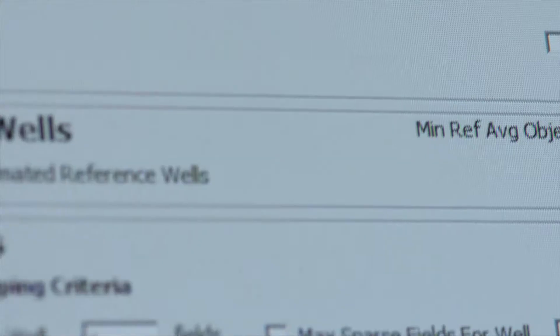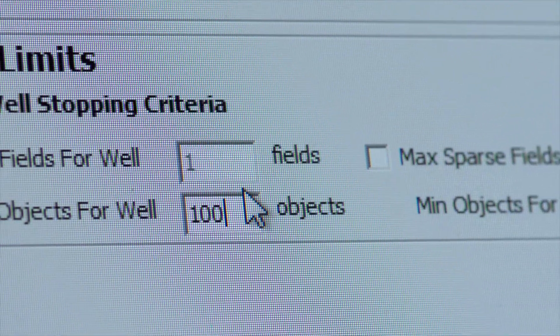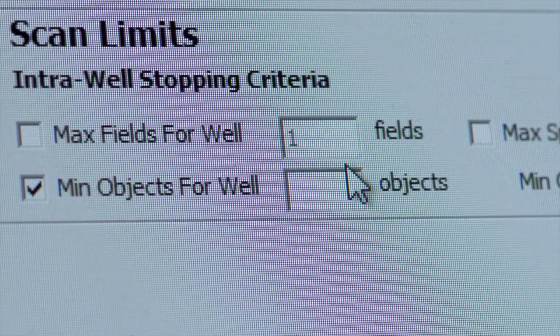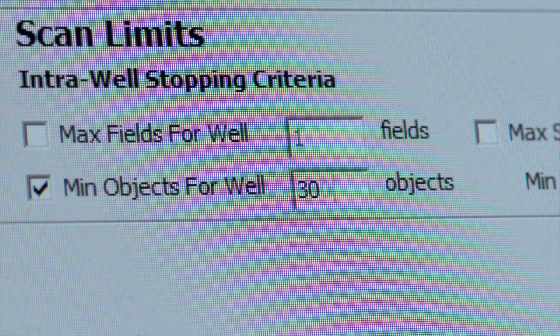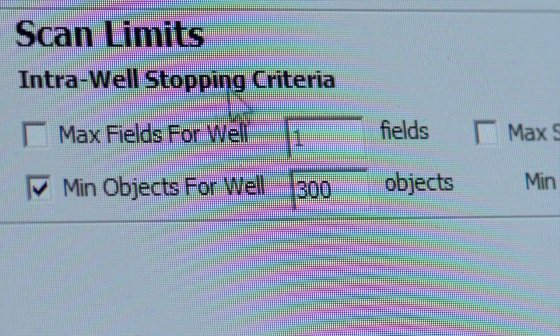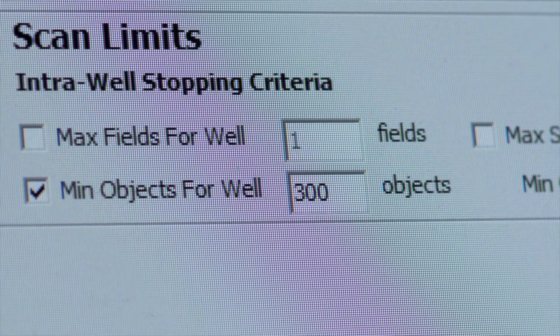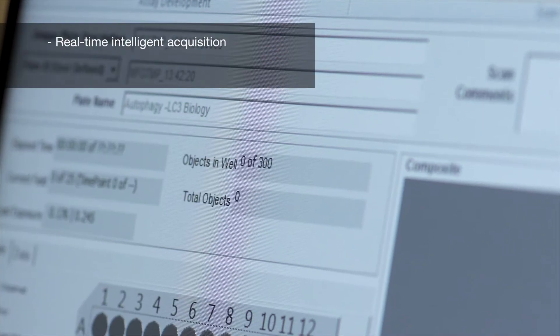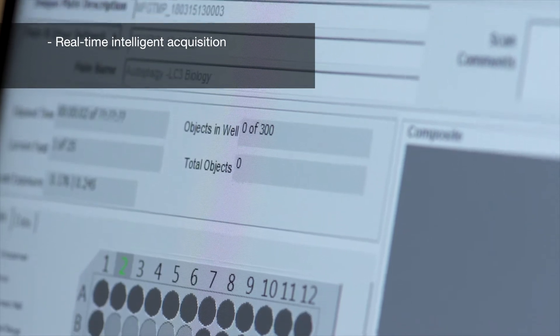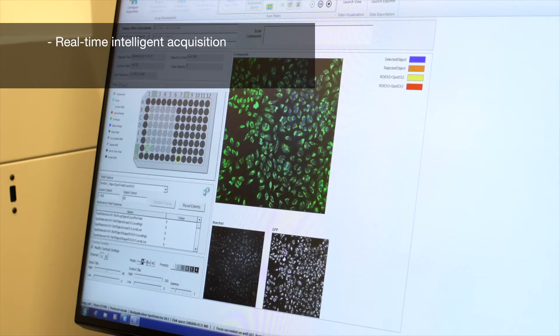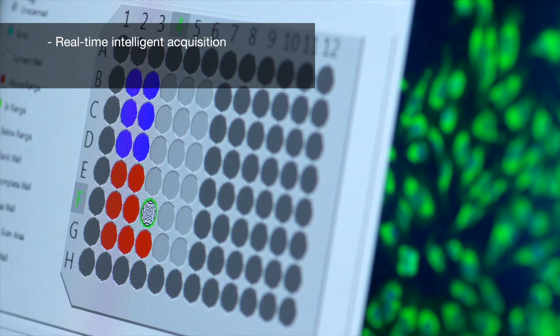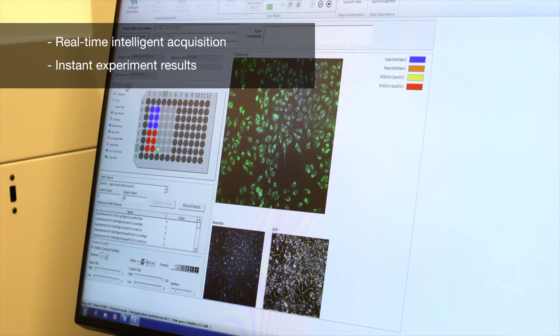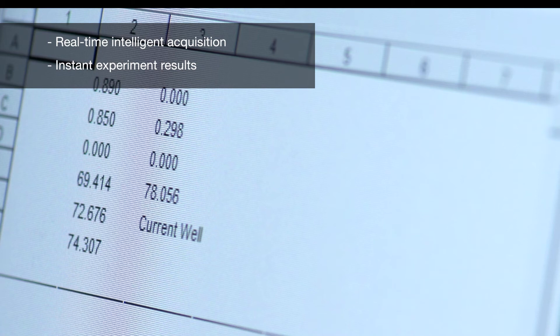The intelligent acquisition feature with the flexibility to stop makes your biology data more statistically relevant. For example, it allows you to check if you're counting an equal number of cells. This allows real-time intelligent acquisition and on-the-fly analysis. You can see the data being generated as the images are captured, thereby instantly knowing if the experiment was a success rather than having to wait for hours.